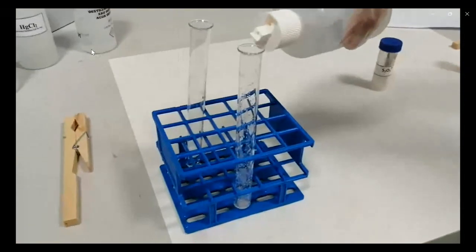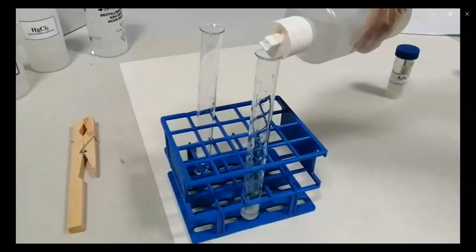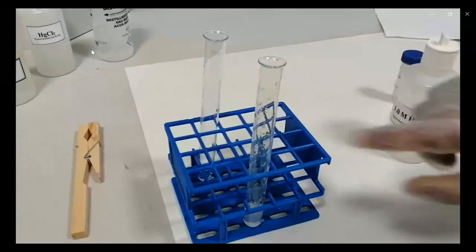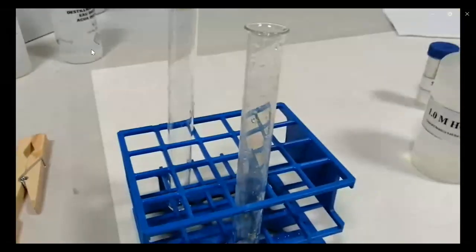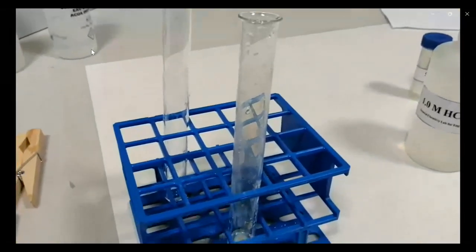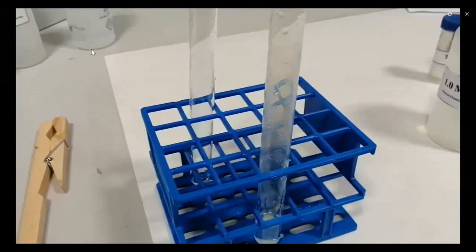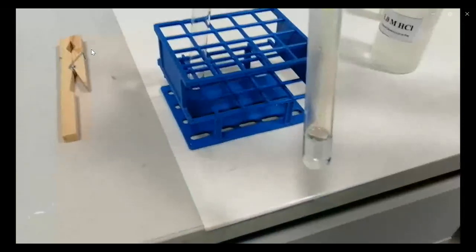You will see effervescence and NO evolves, but the reaction is not as strong as with carbonate. Once this gas NO reaches the top of the tube, it is converted to brown fumes.